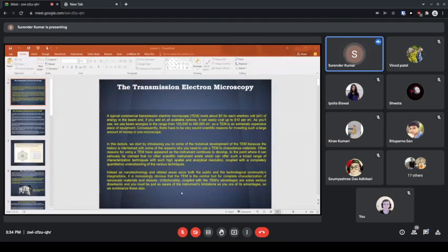Means you can see 4 picometer inside your sample. The resolution is this, 0.004 nanometer. So you can see resolution with size smaller than the diameter of an atom.